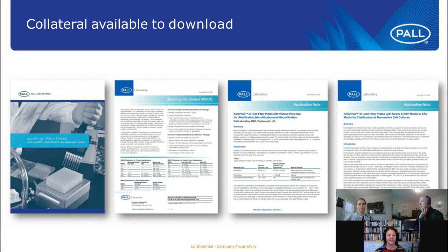All right, great, thank you. And it looks like we have time for one more question. Are processing parameters the same for all plates, i.e. will it take the same time, require the same speed, et cetera? So typically the time to process samples will vary depending on membrane type, membrane pore size, as well as the application, in addition to sample characteristics. So it just really depends on the sample. It would not be exactly the same, but we do have recommendations in terms of the maximum volume that you should use to start with, what the speed would be if you're using centrifugation, and the time that it needs to optimally filtrate that sample.